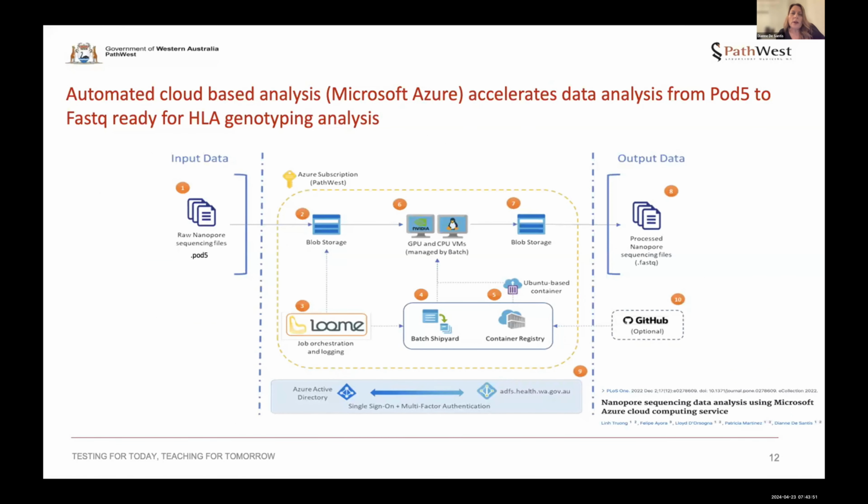We found at the time that we were generating quite a lot of data, and analyzing that data using Linux commands to do the base calling and the filtering, etc., was taking up to 3 days. So we needed to develop something that used GPU power and that was quick. And so we worked with Microsoft and BizData, who was a consultant in New Zealand, in developing a pipeline that is housed in the Azure environment.